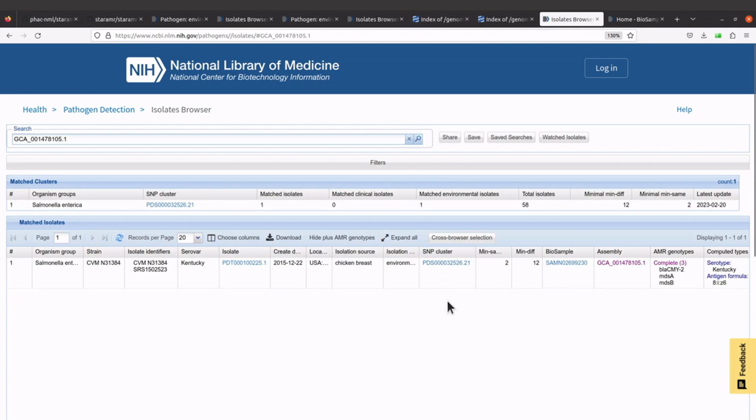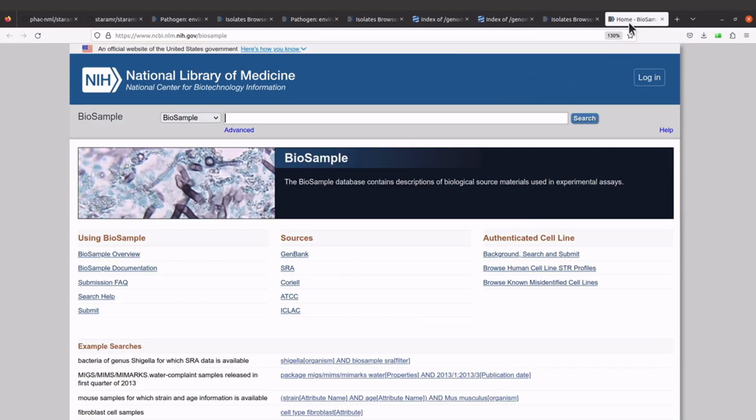Once you search, if your session ID is correct, then the page will be open for you. So we can see the page. This is what we did previously when we visited this page. But now we are searching ourselves. So this is how we do it. You can do the same for the phenotypes as well.